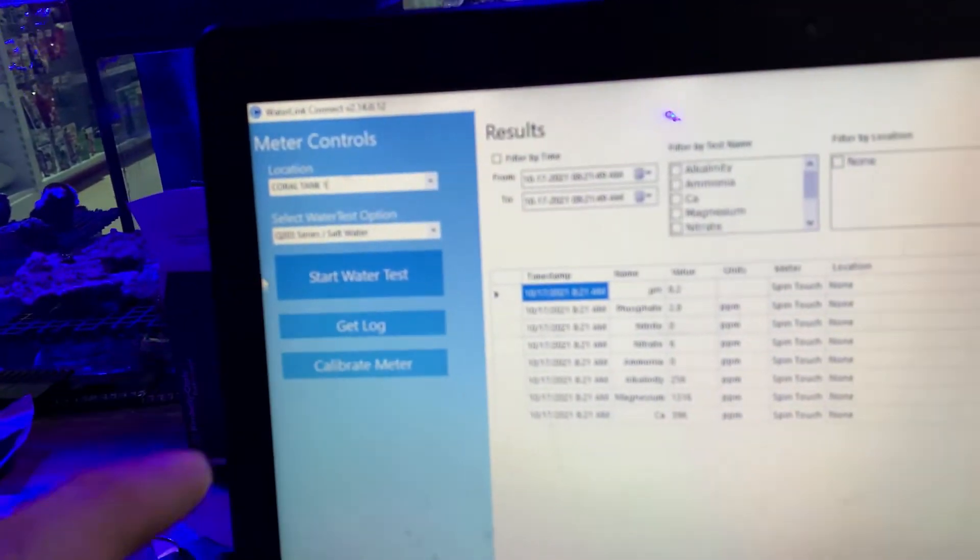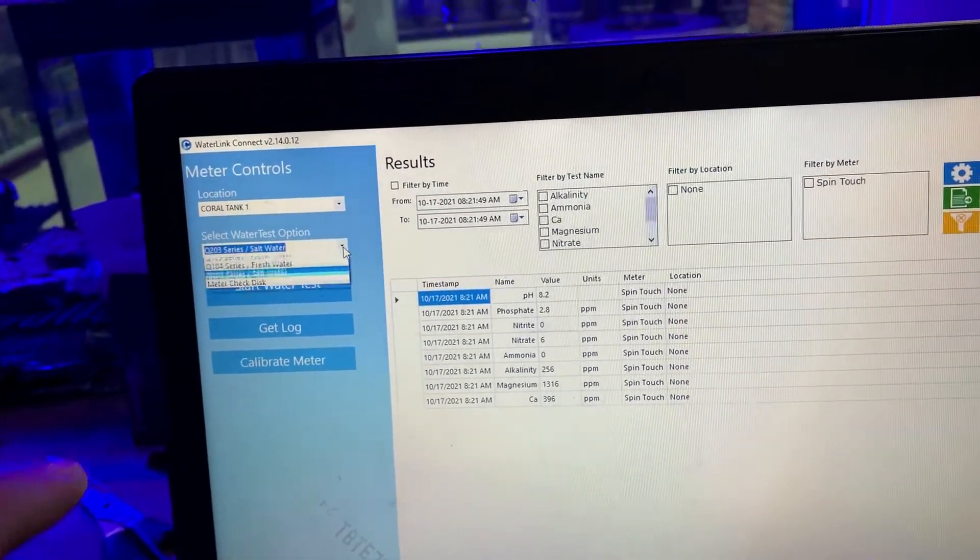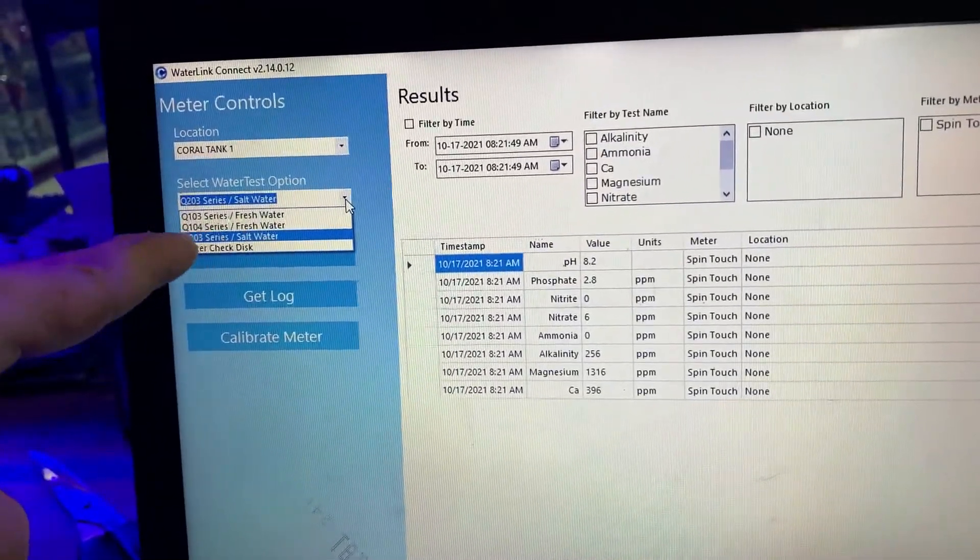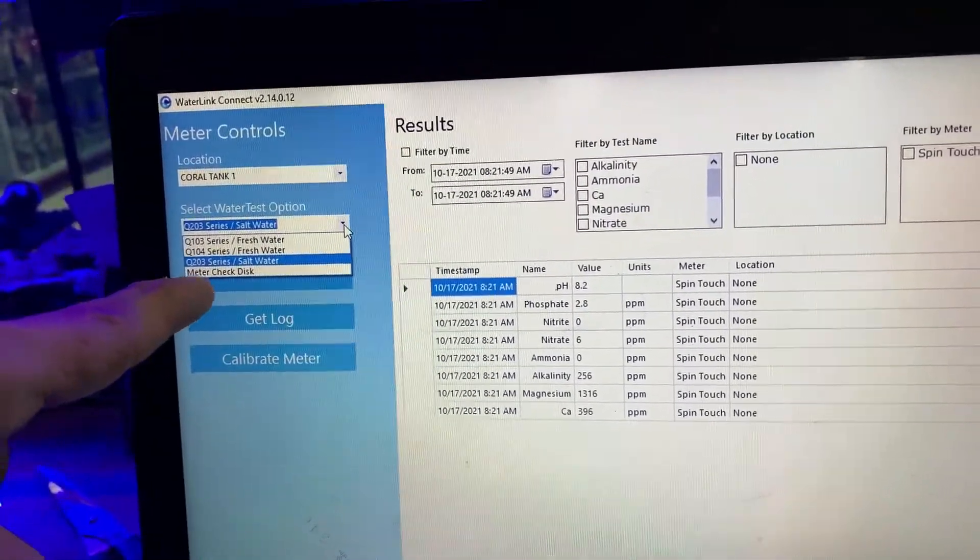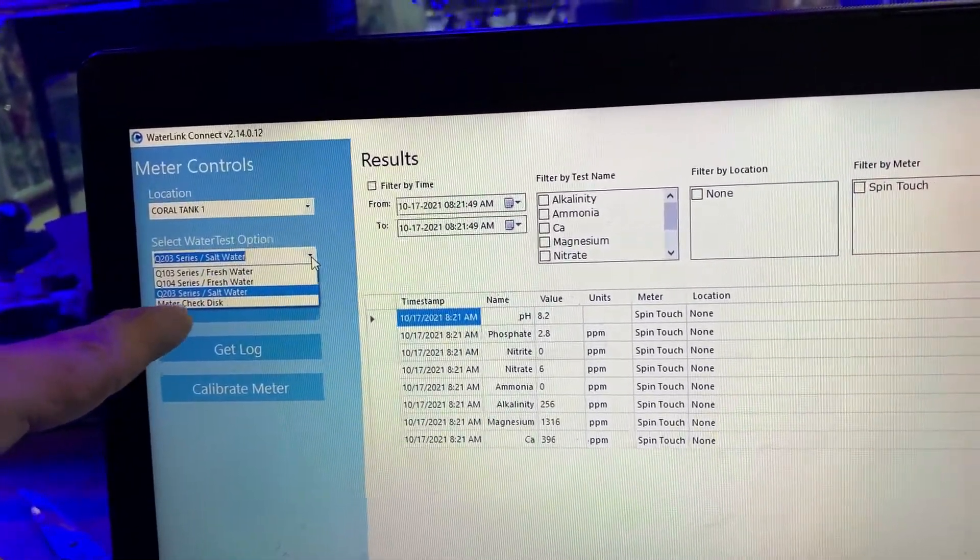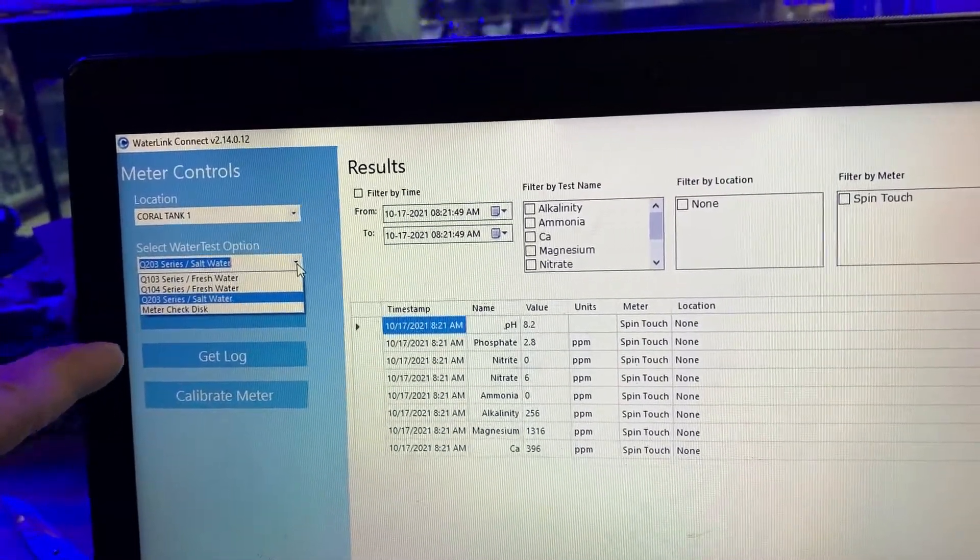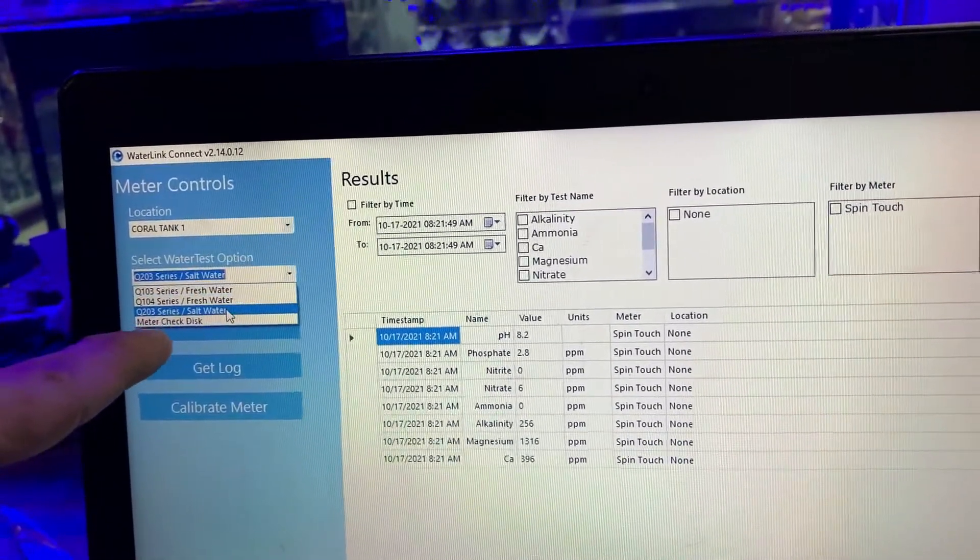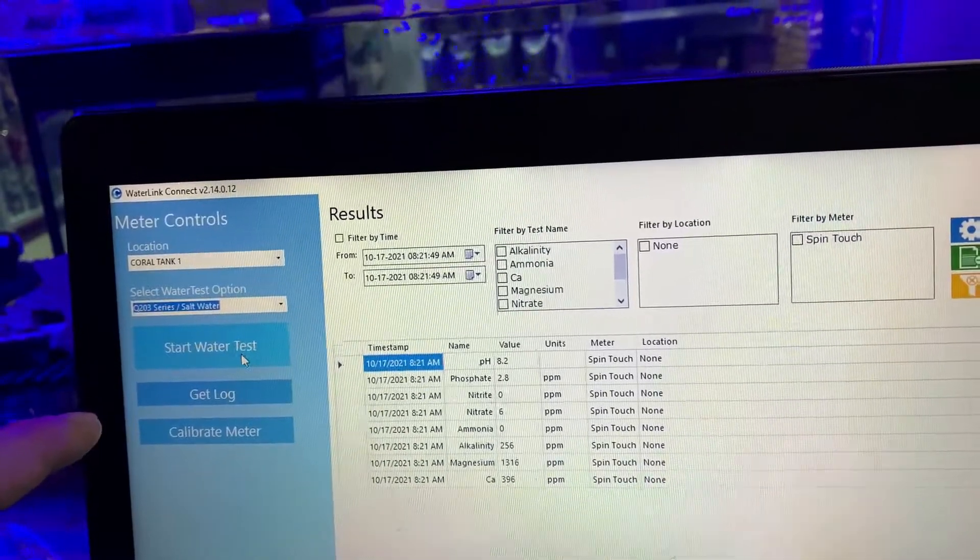I choose salt water. There's some option here where you can choose fresh water, then salt water. Then, method check disc. This method check disc is actually for calibration. What we are going to do now is test the salt water. Let's start.